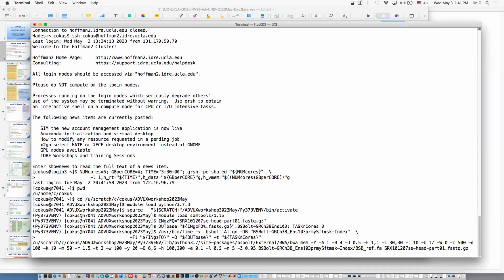So the very first thing BWA does is probably read in that indexed reference genome. So this pause here is probably it doing all the I/O. It's just sucking those huge disk files into RAM, and that's what this pause is. I expect to see in a few seconds, 30 seconds or something, this initial phase finish. Then it should give us some more progress information as it actually starts aligning.